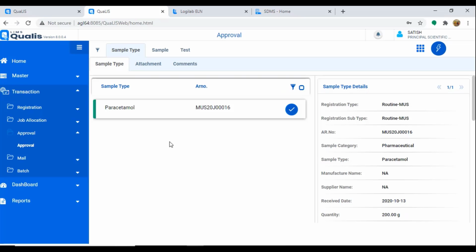Reports in our LIMS is rather a configurable area. The way we implement LIMS is we understand the reporting requirements of customer, because every time when we do the implementation, we have to touch the report at least for the header and footer. We have to add their logo. We have to add the report name, company name. So every time we deploy LIMS, we definitely have to work on the reports. So we study the report requirement and we design these reports and implement.